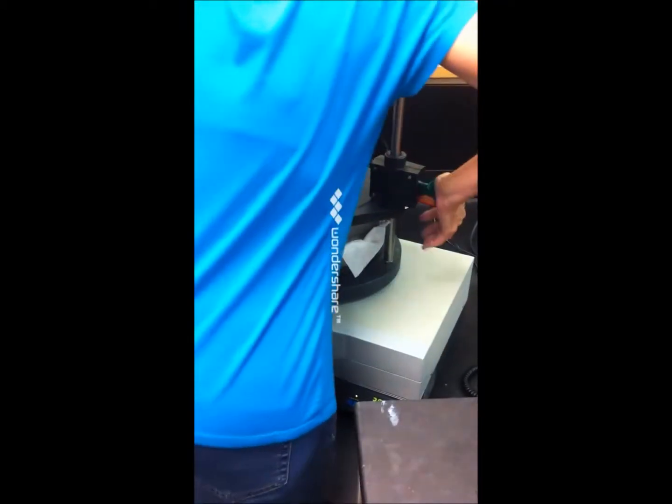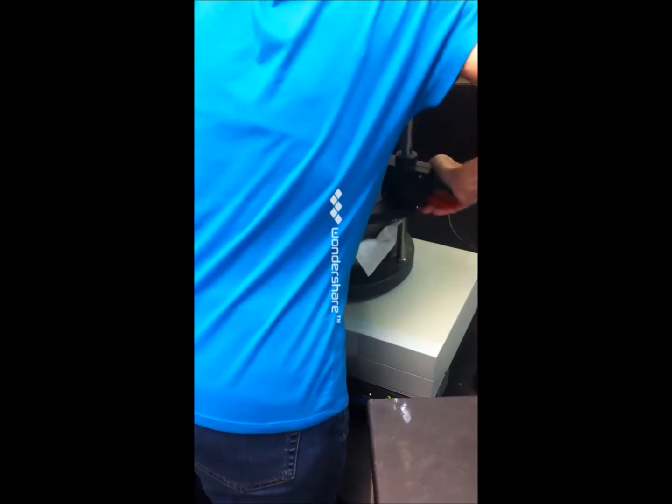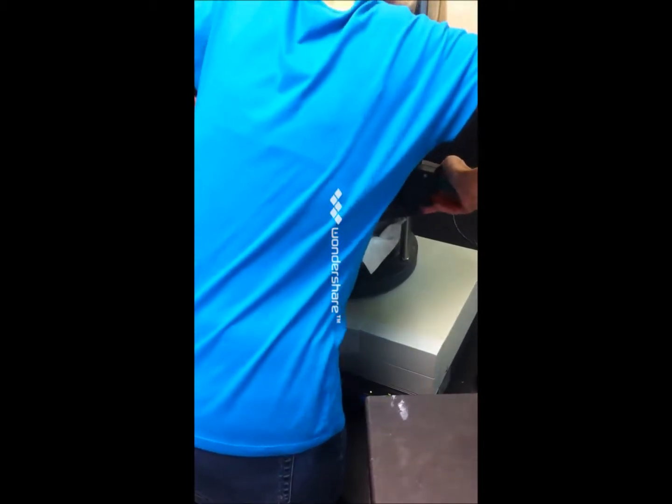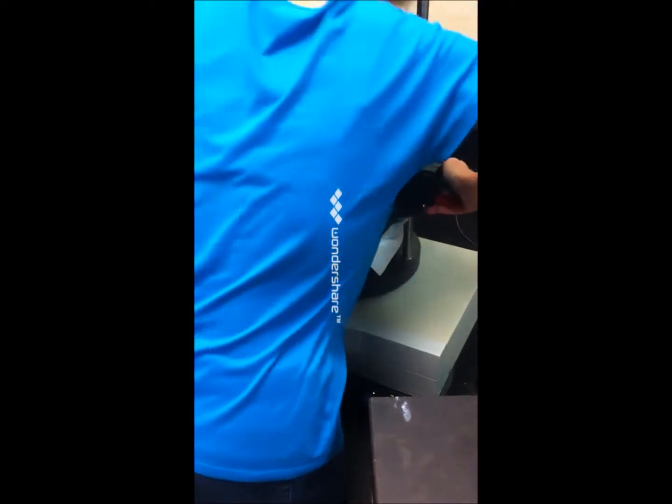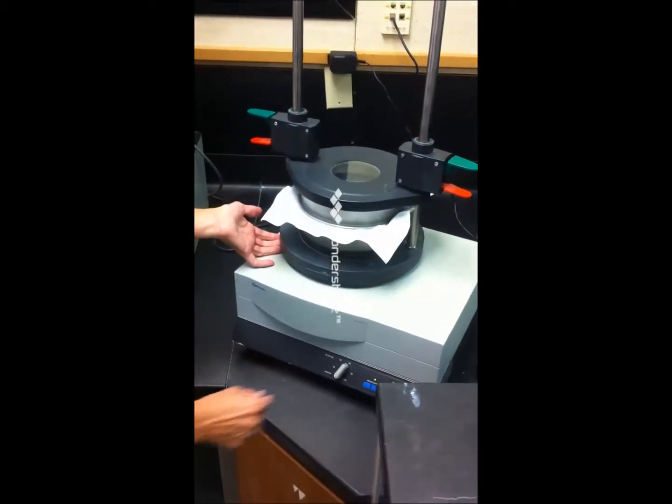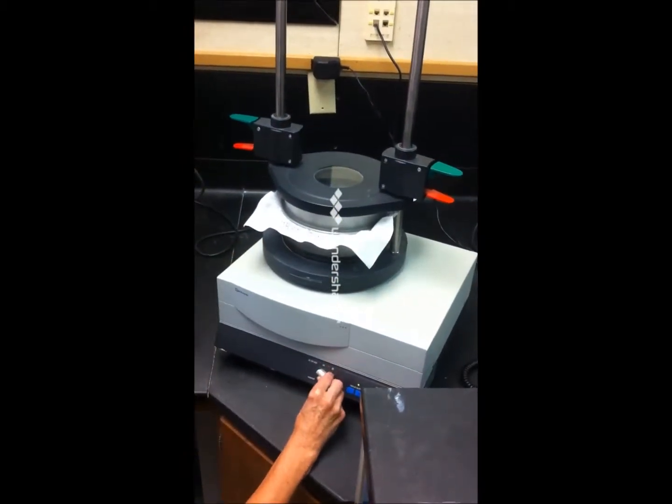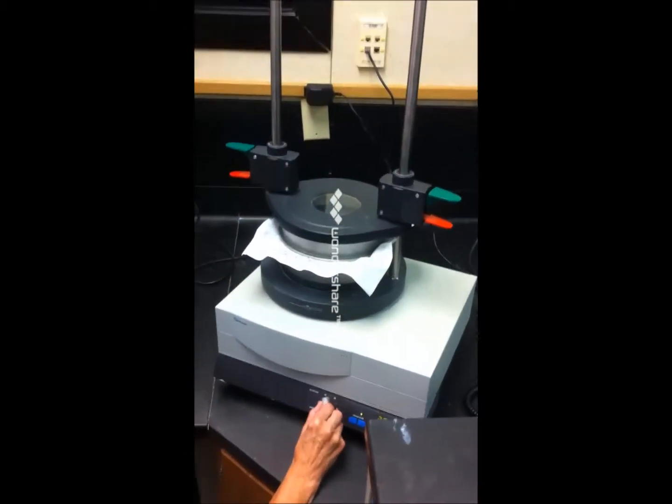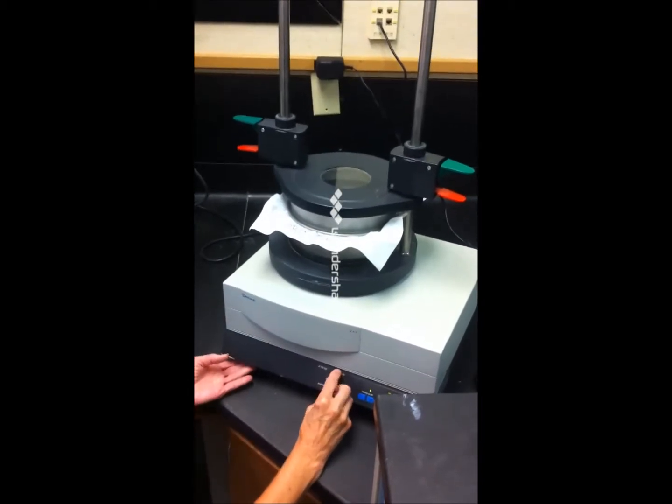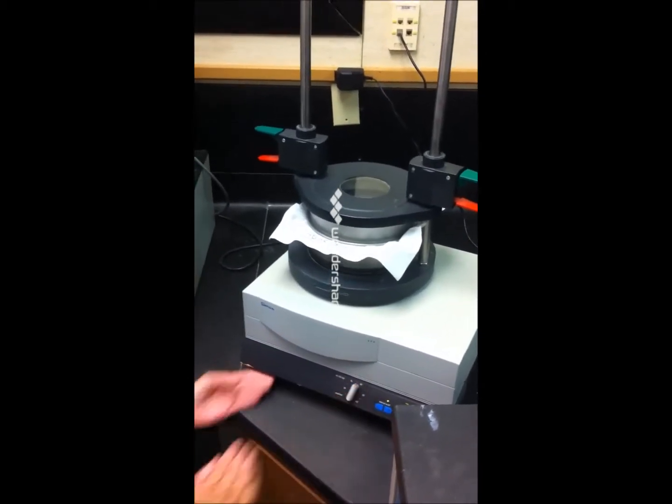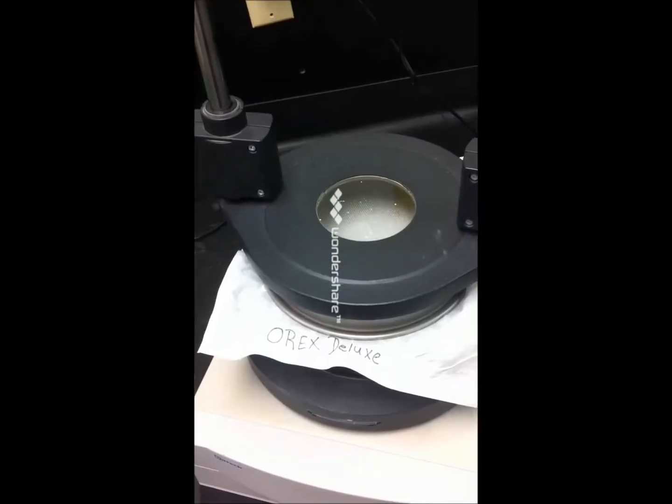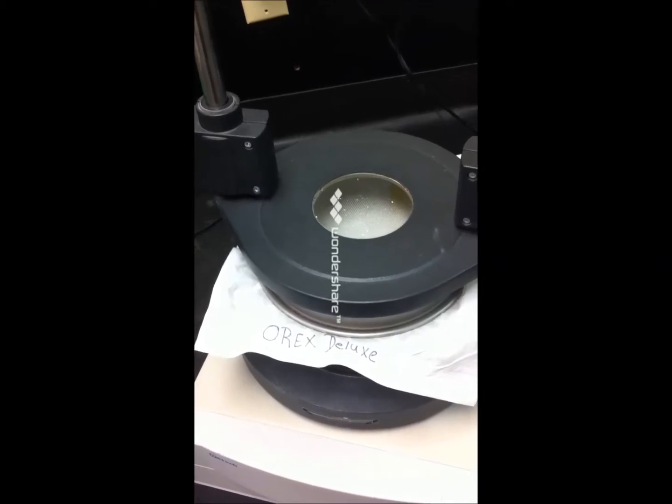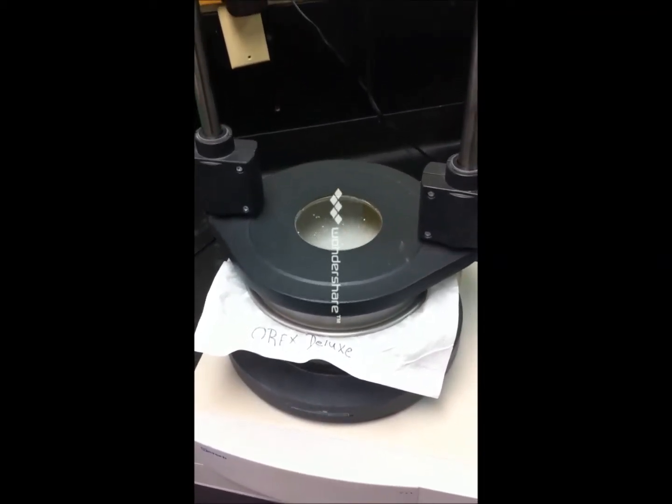Clamp it in place and we'll start the vibration process. Like I said, this lasts for about 30 minutes. Okay, the 30 minutes is over with.